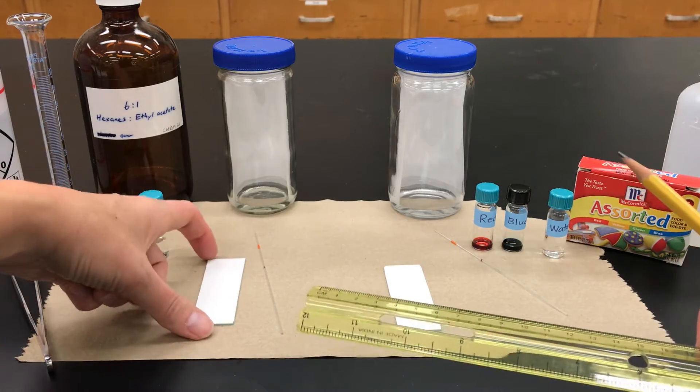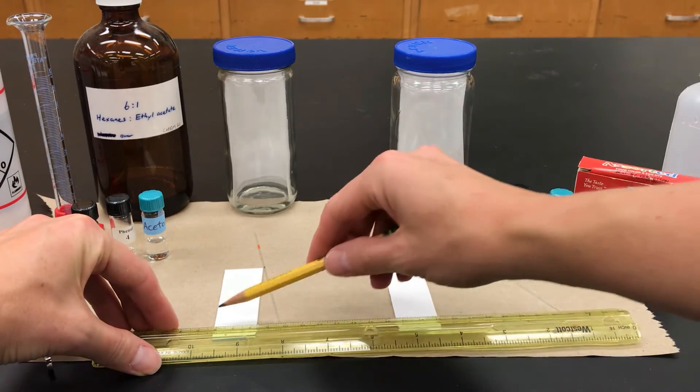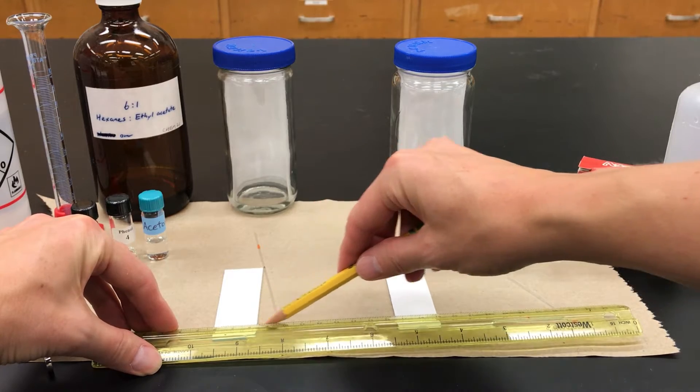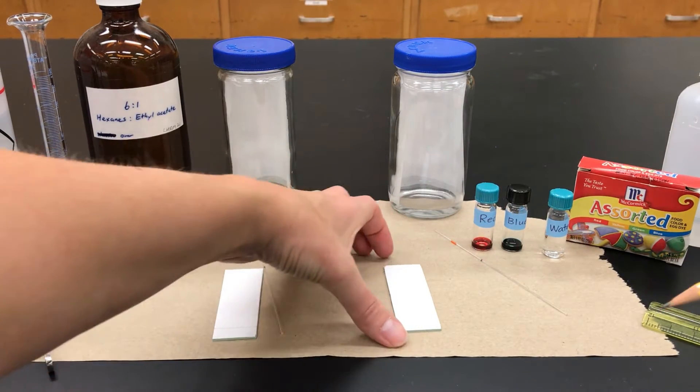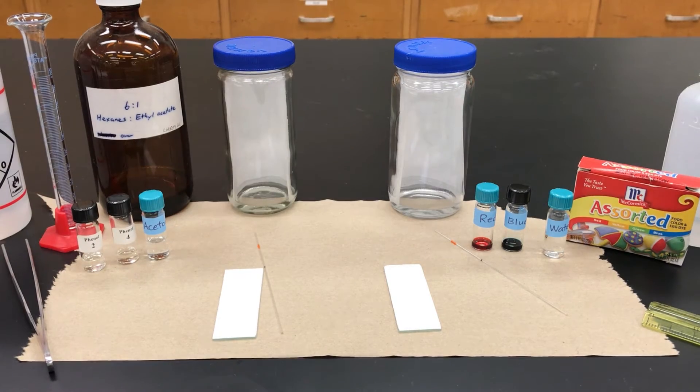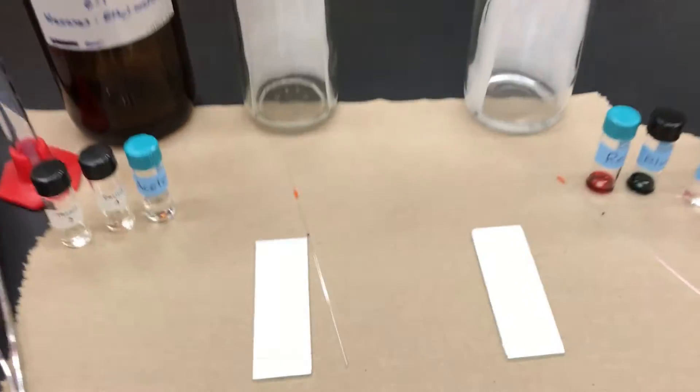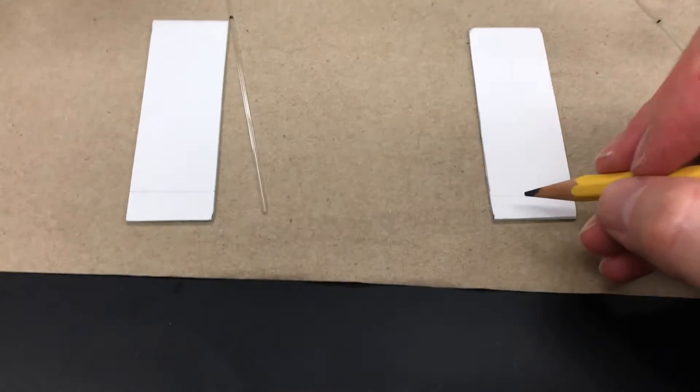What I'm now doing is using a ruler and marking a line roughly a centimeter or so from the bottom. I'm doing this very lightly. You don't want to gouge the silica, don't make a pit. You're just really lightly with the ruler drawing a faint line.